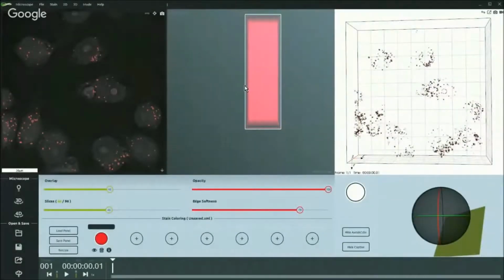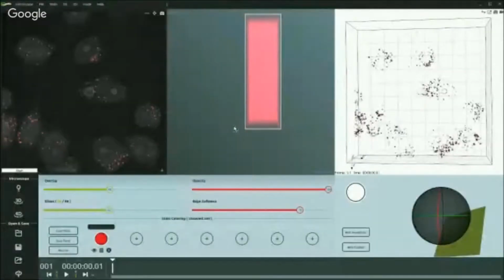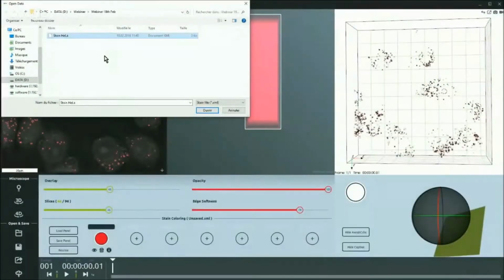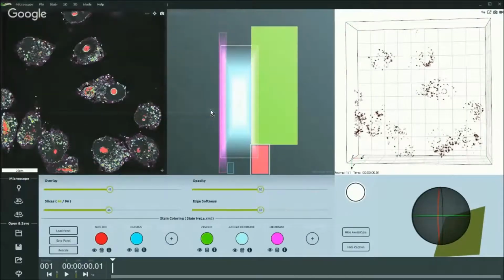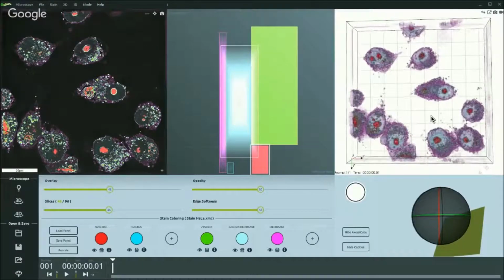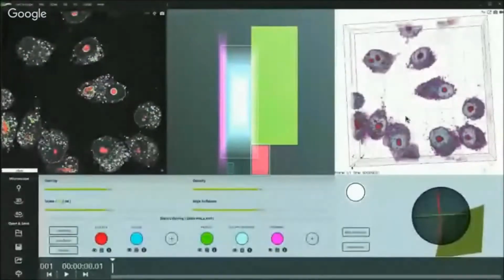Now, since we've been talking about marking, let me tell you that this panel here can be saved just by pushing this button, okay? Or even better, after you record it, it can be applied again to your sample over and over. So you can go here and select this stain that we prepared very early this morning. You can just double click and boom, you have your stain applied in a fraction of a second. And this is what you can obtain just by a couple of clicks.